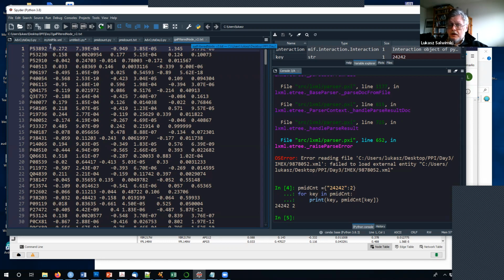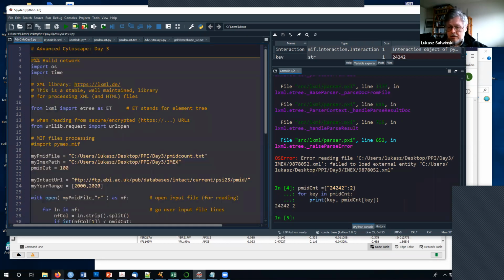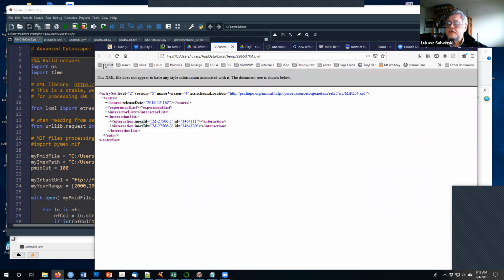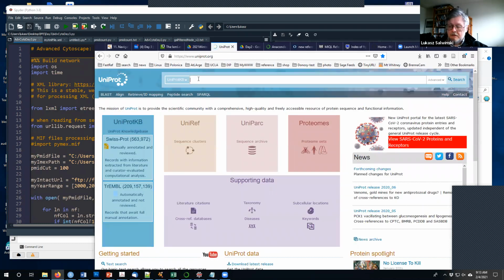How to do it? Well, first thing to notice, as I mentioned yesterday, is that once you go to Uniprot, let me see if I got it somewhere. No, I don't. So let's go to Uniprot. Okay. So if you've got an entry here, let's say gal 80.